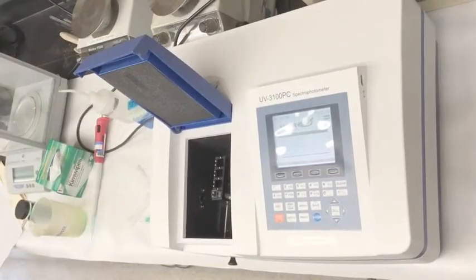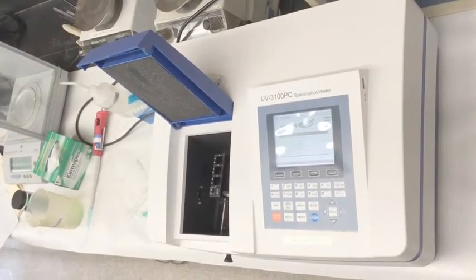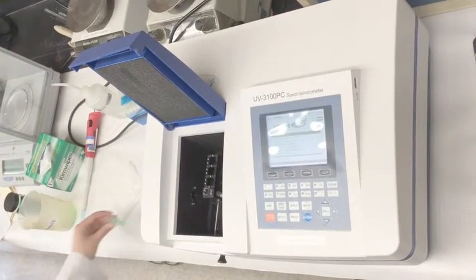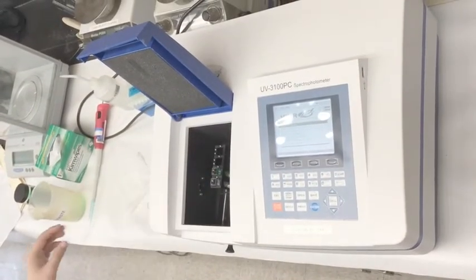We will now begin to insert the sample cuvettes into positions 2, 3, and 4. This is counting away from you in the machine. Make sure all of the arrows are lining up in the direction the light will be passing through the machine.